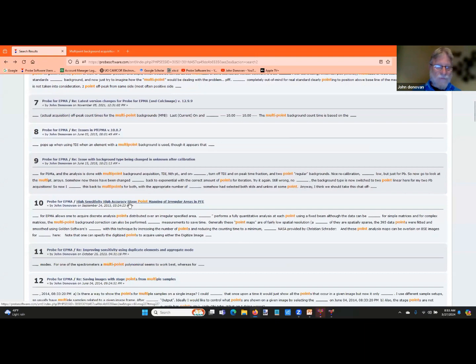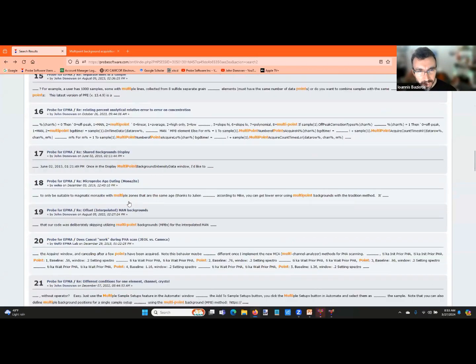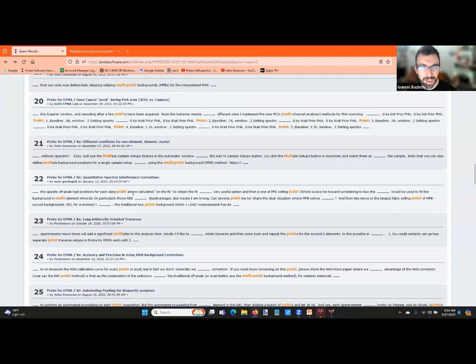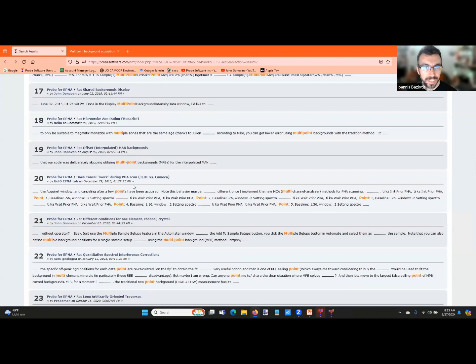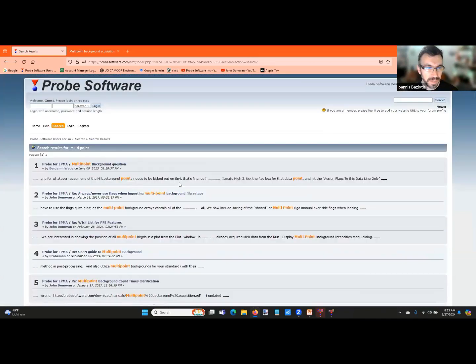So it's pretty powerful. Okay, another question is, can you set also probe image to acquire qualitative WDS maps, so only intensities? That is quicker to have a full thin section map acquisition, of course. You can just acquire maps and not quantify them. Sure, of course. The quantification is an extra step. Basically, you can acquire raw maps.